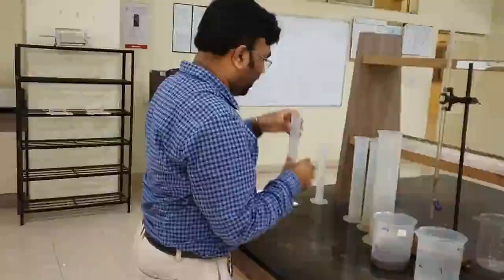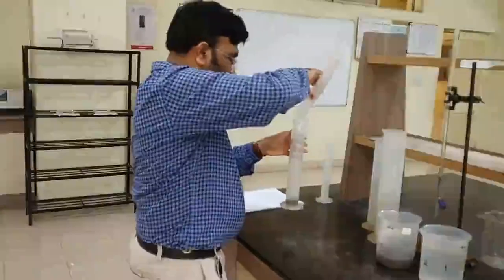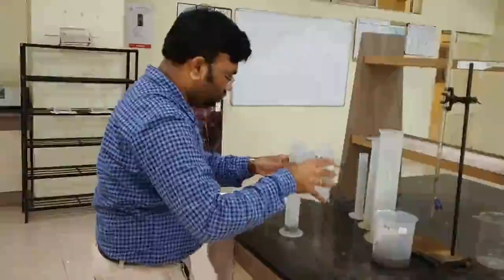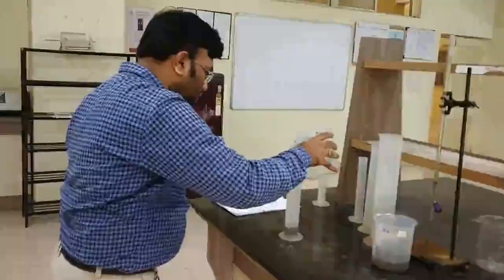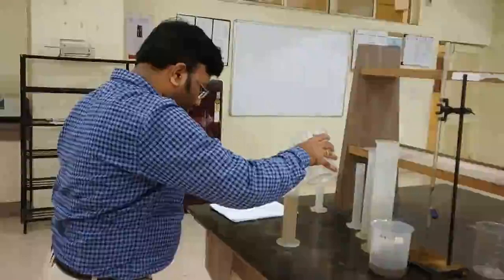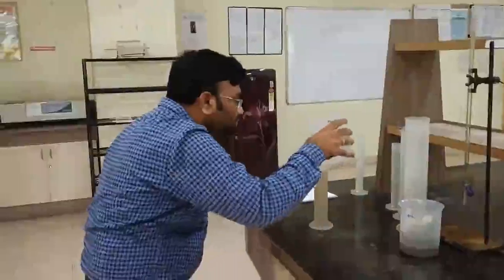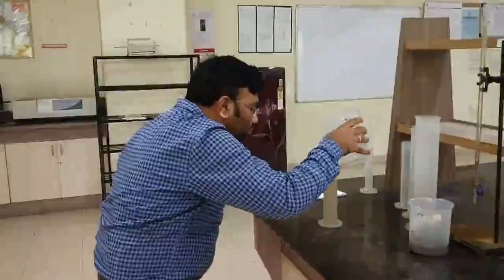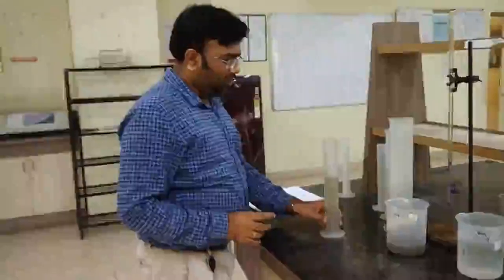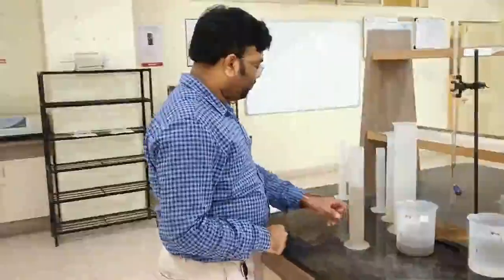And then I am going to add it to the 250 ml measuring cylinder. Now the total volume I require is 250 ml, so I will be adding distilled water to make the total volume 250 ml. So now we have got the total volume as 250 ml. By completing the first step, we have achieved a dilution factor of 10, that is 250 divided by 25.